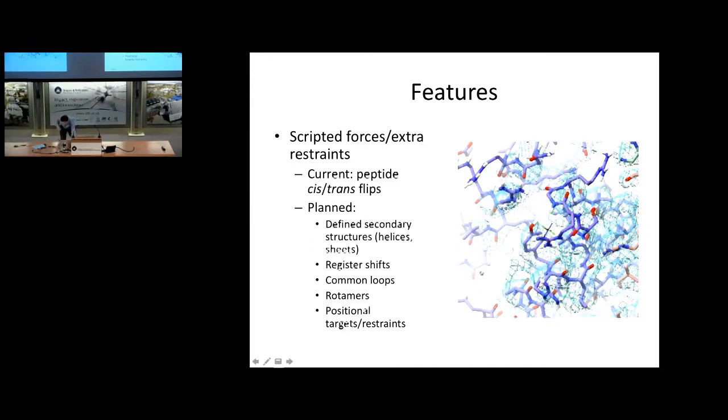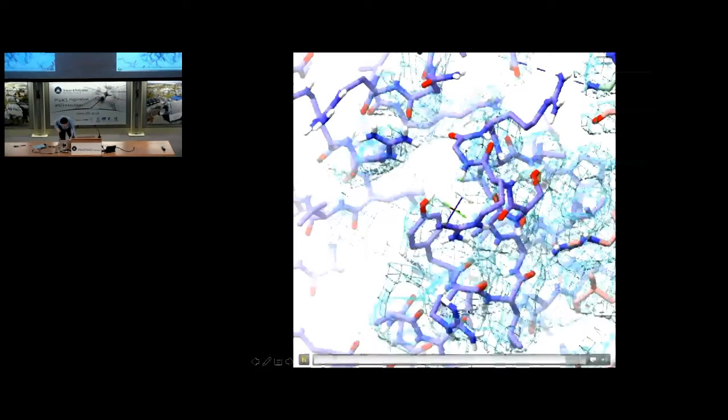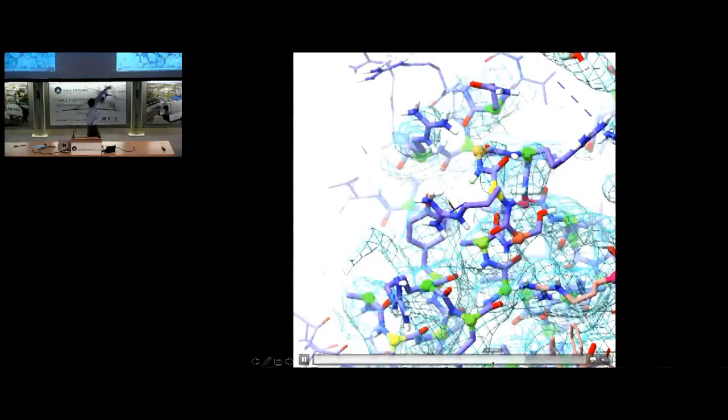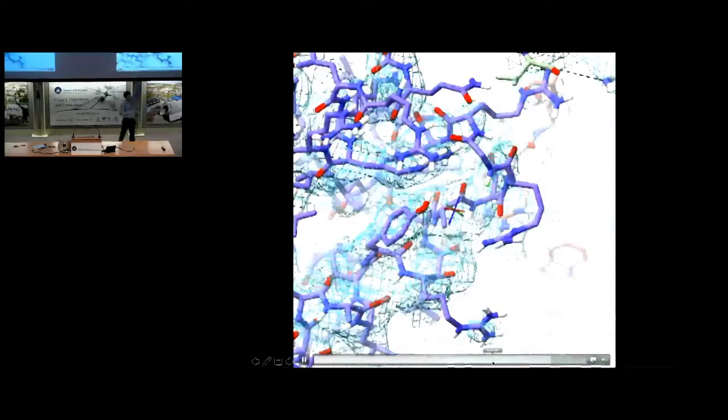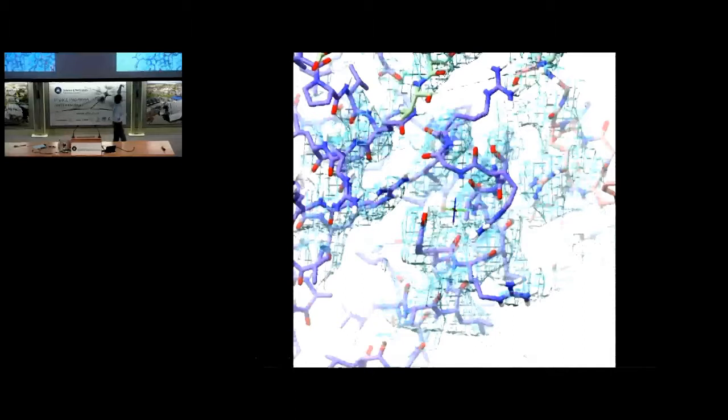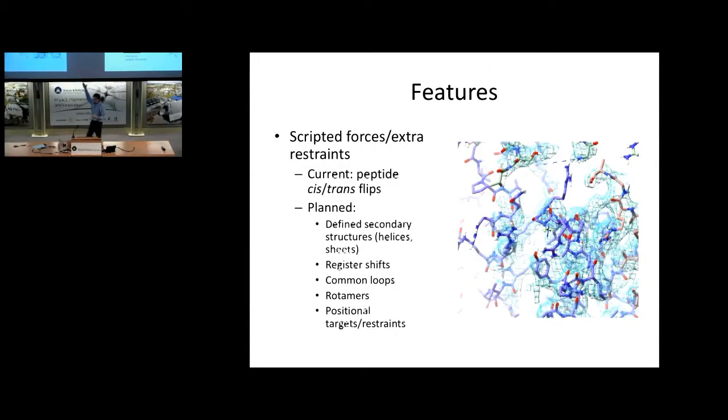And then situations, actually like something, if we start this one again, you'll see good examples here. Me playing around with the mouse, pulling the backbone around, where the environment, well, you can see an example of the environment really helping you in that you try to pull it into a conformation that it doesn't want to be, it will simply go straight back to where it was, telling you quite clearly that that's not favourable. But sometimes it goes back there simply because the surroundings are wrong.